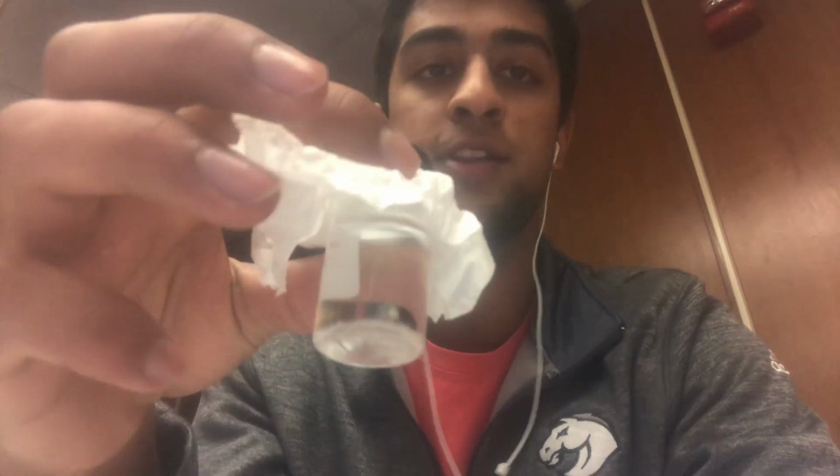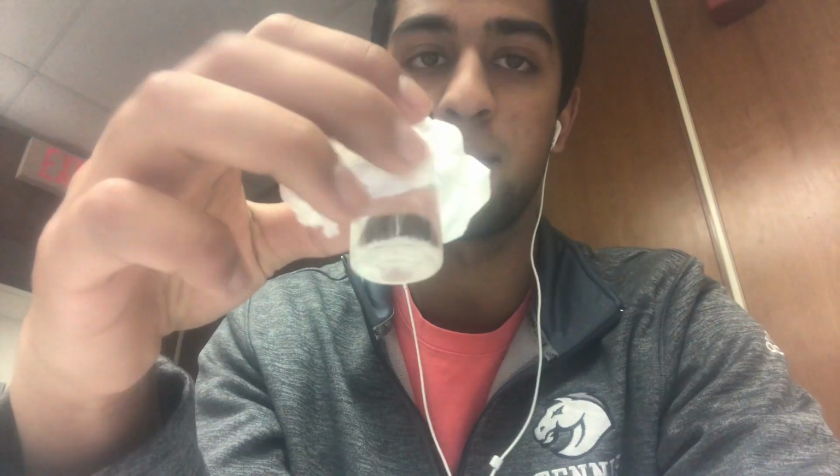So then, once we were left with the solid alum precipitate, we rinsed it to get rid of the impurities and measured the mass. After that, we mixed it with water to make a saturated solution, and here we are. We put it in a vial with a tissue paper on top to allow it to evaporate without letting the solid alum crystals escape.